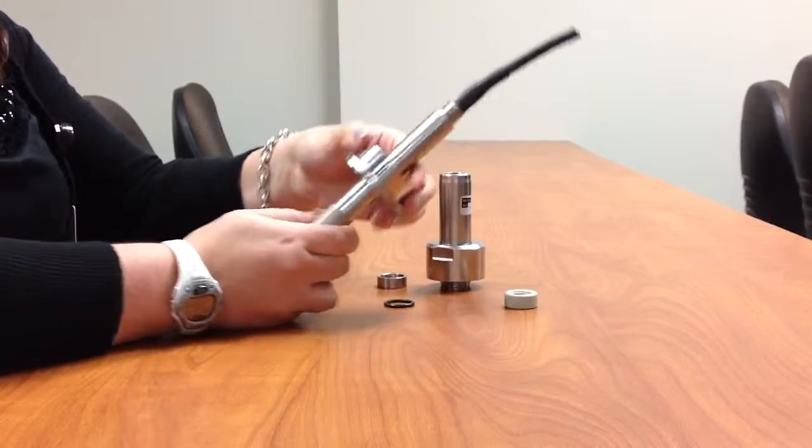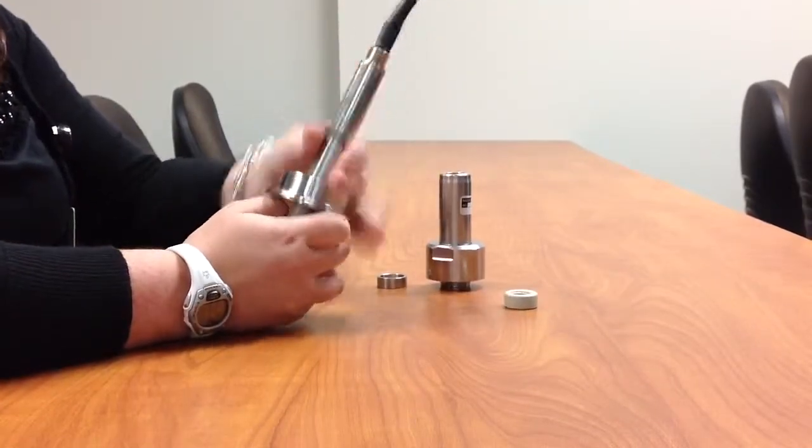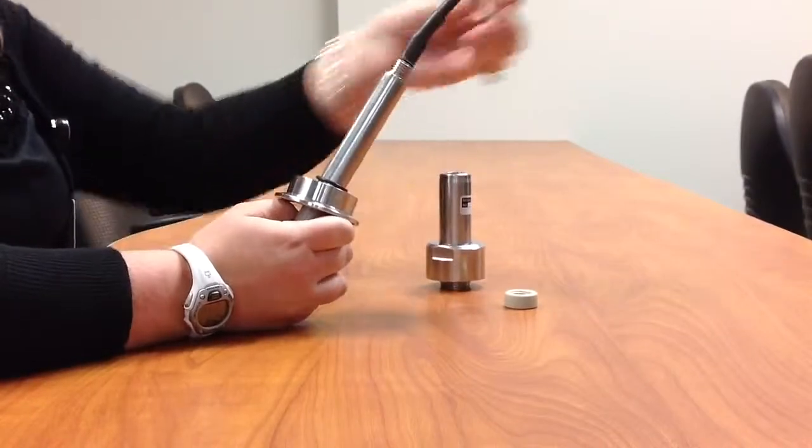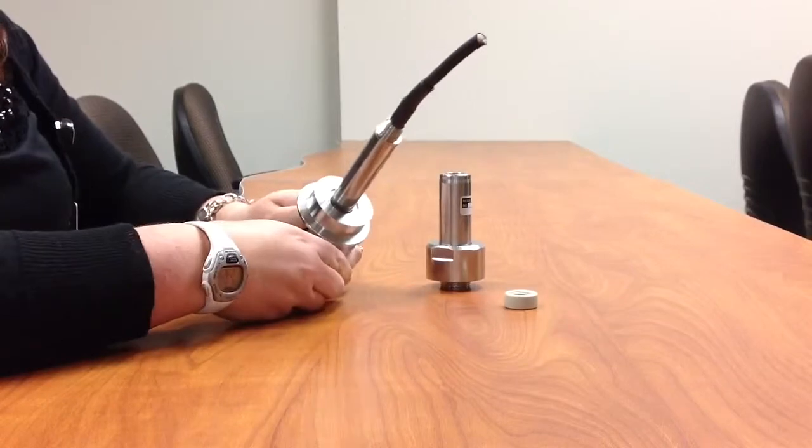First, your process connection piece goes on your sensor, then the O-ring, then the sealing ring, and they basically just sit right up in there.